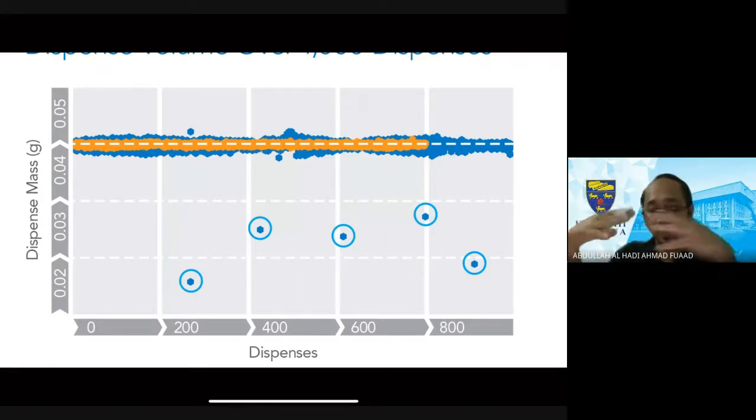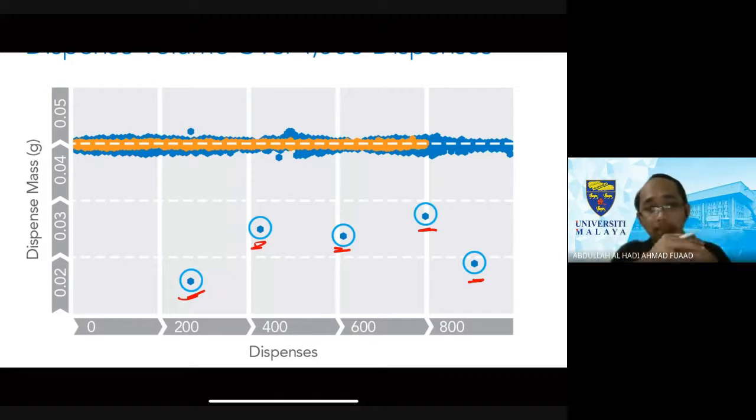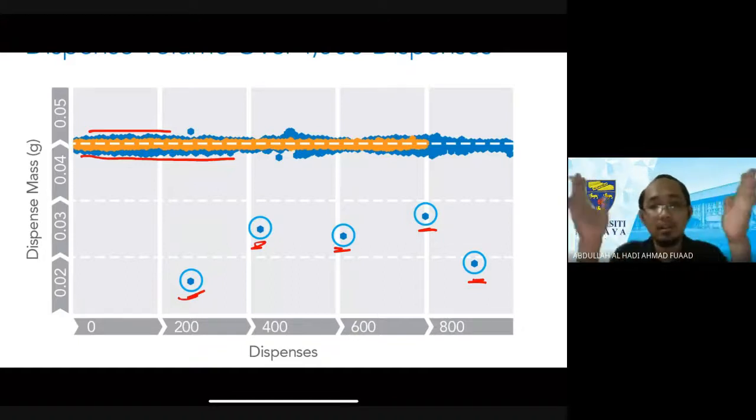However, if your system does not have a degassing system, you might accidentally once in a while get an outlier. And this outlier can actually come from bubbling. It forms huge chunks of bubble, and this chunk of bubble can actually affect your system reading.